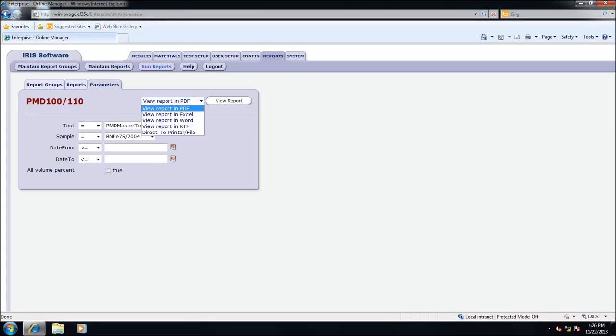This concludes our demonstration video for the basic layout and features of Iris. We'll be releasing additional videos to cover specific modules and/or advanced features.